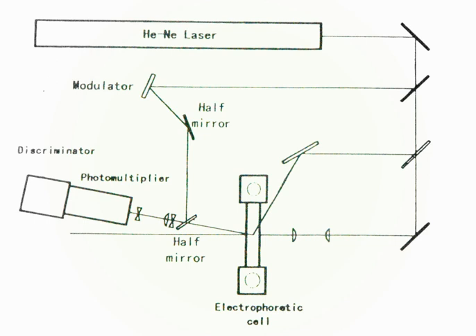The width of a Doppler-shifted spectrum of light that is scattered from a solution of macromolecules is proportional to the diffusion coefficient. The Doppler shift is proportional to the electrophoretic mobility of a macromolecule. From studies that have applied this method to poly-L-lysine, ELS is believed to monitor fluctuation mobilities in the presence of solvents with varying salt concentrations.